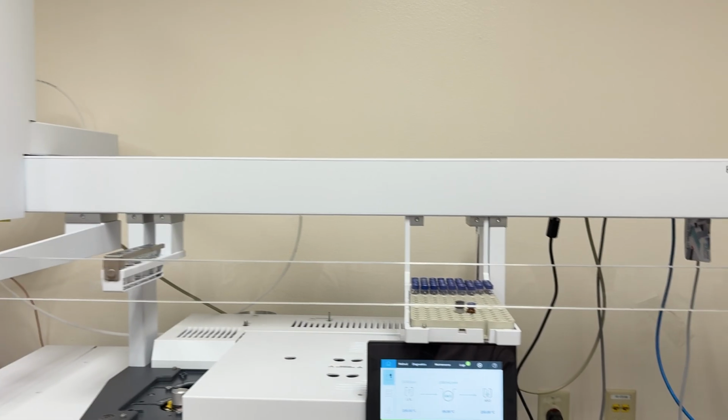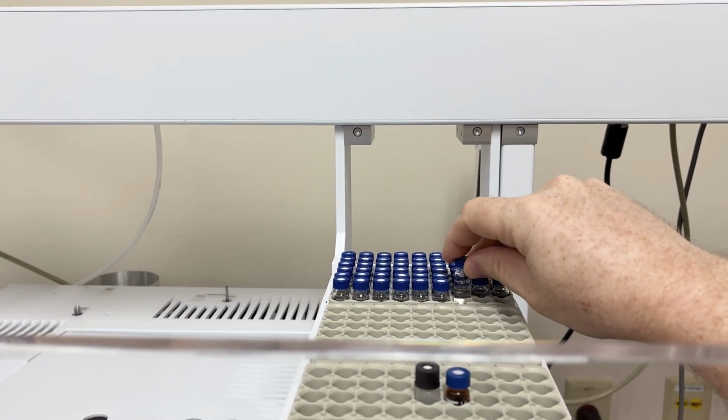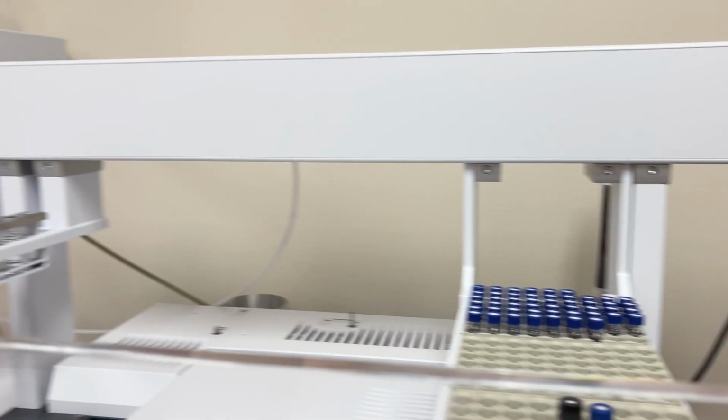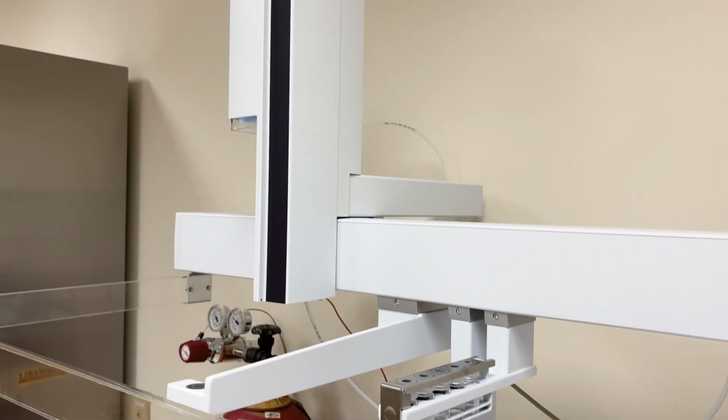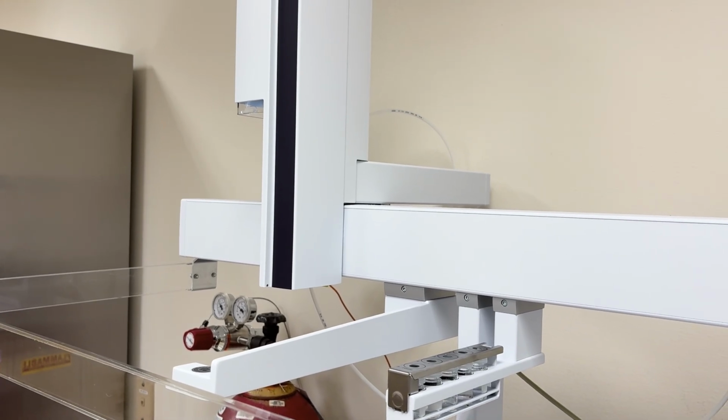After checking the gas, you're ready to load up your samples in the sample tray over here. Now, do not put your hand past that bar if that robot arm over there is moving, or if it looks like based on the software that it is about to move.